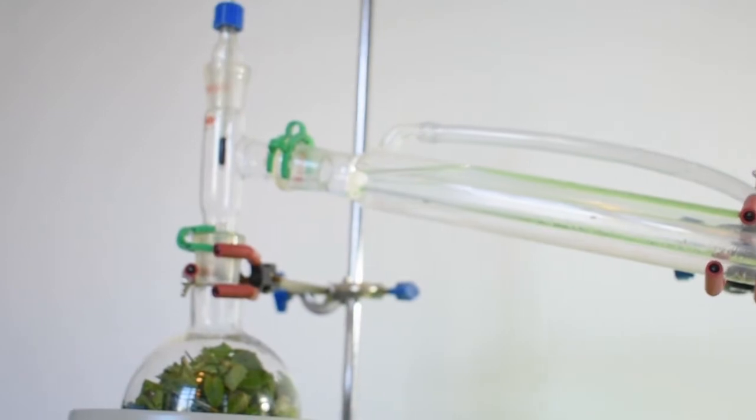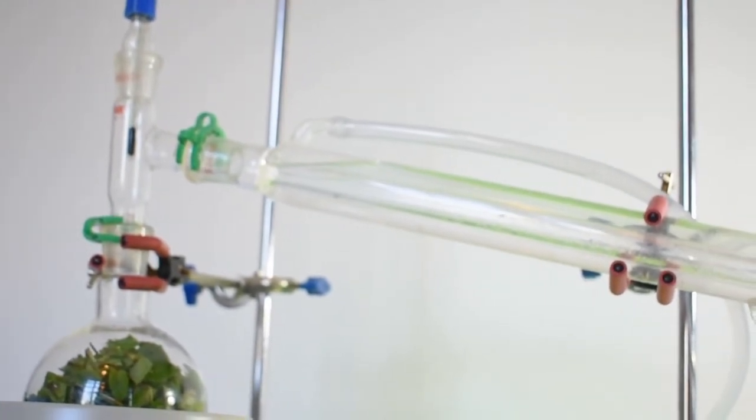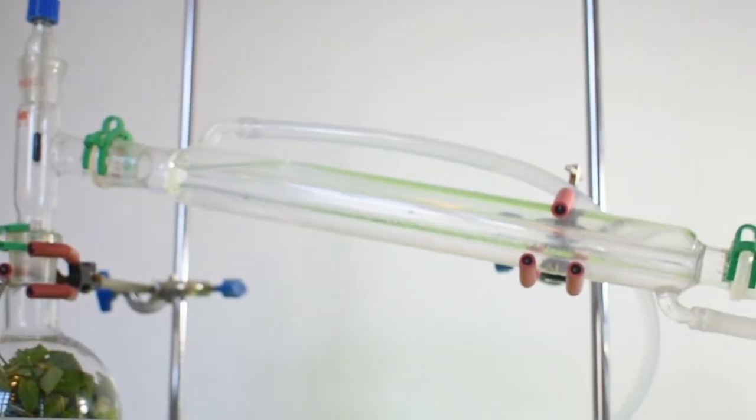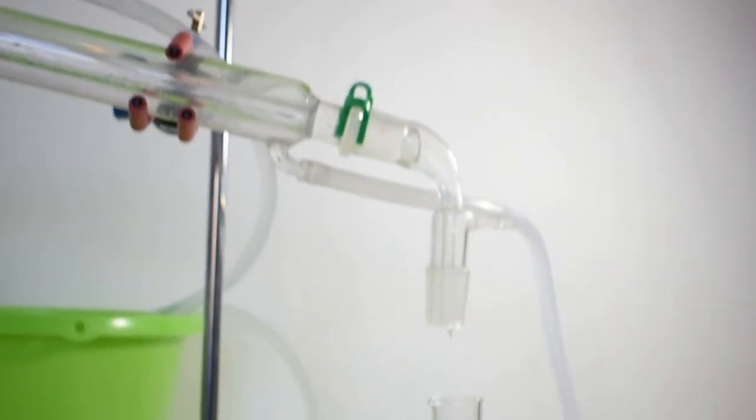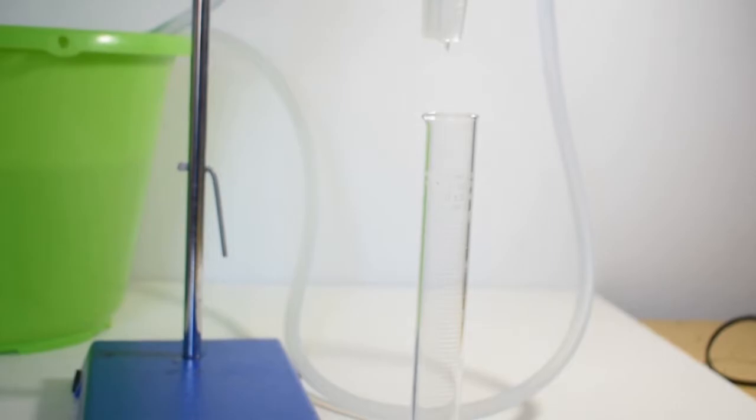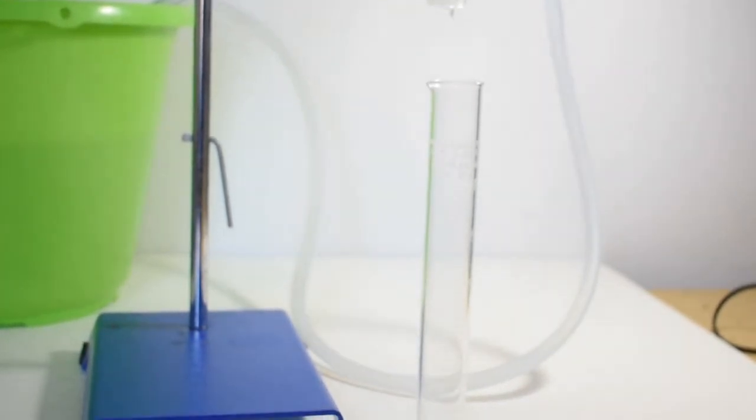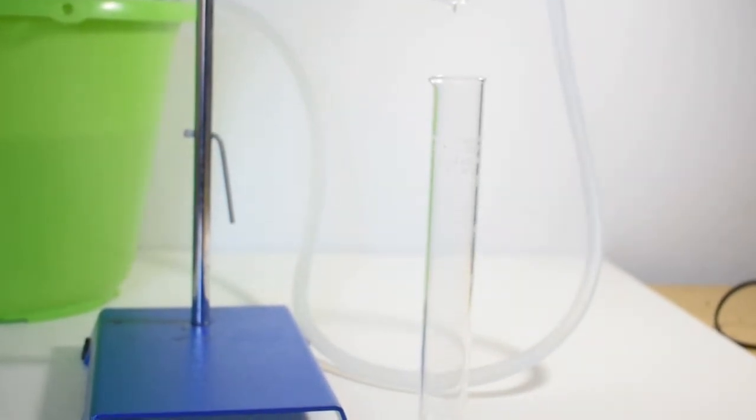The vapors will then travel into this condenser, then run along the condenser into this vacuum adapter and drip down into a measuring cylinder where we can collect the distillate in measured volumes.